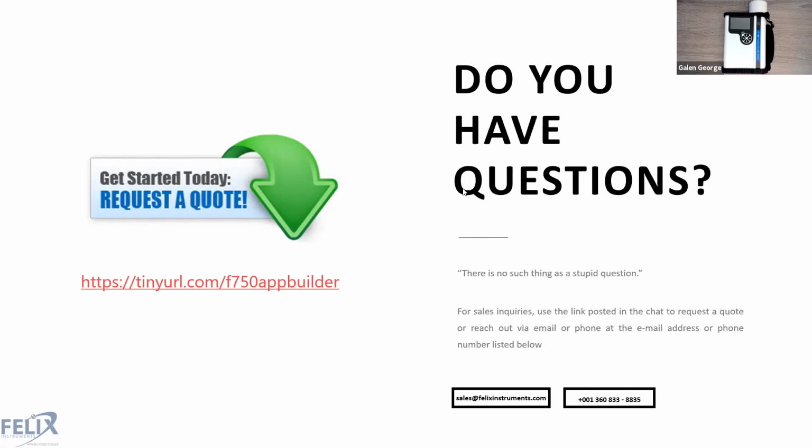The next question is, can I use Model Builder software with spectra from a spectrometer of another company? And that is actually a great question. So as you saw with AppBuilder, the text import feature allows you to import a CSV that has spectral values in it. So technically, as long as you have a CSV that has spectral values in it, then yes, you could build models with it.